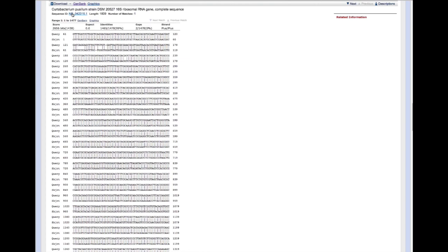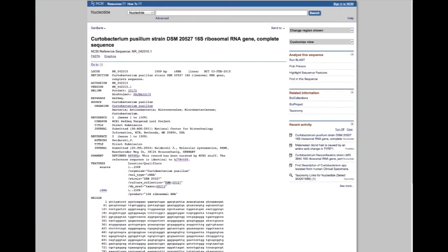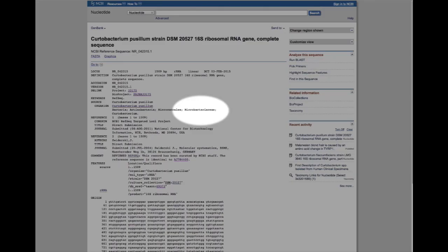So, Professor, what is this species? Anderson, I'm afraid I haven't the faintest idea. If we click on the sequence ID, we can find out more about this organism. We can see that the genus Curtobacterium belongs to the family Microbacteriaceae, which also includes the genus Clavibacter, which I've heard of. But still, that hasn't told me anything about Curtobacterium pusillum. We'd better click on the link to the nucleotide database record for Curtobacterium pusillum.